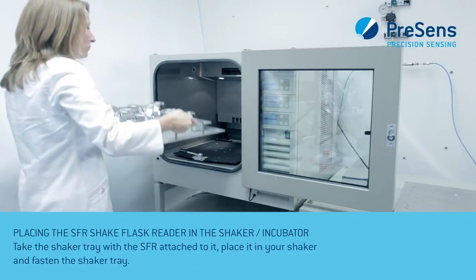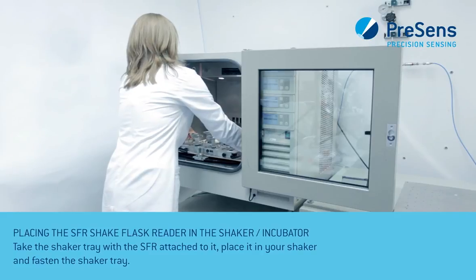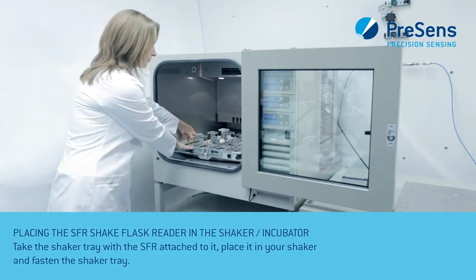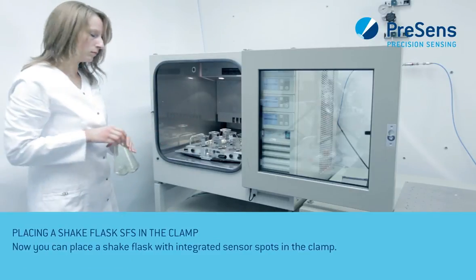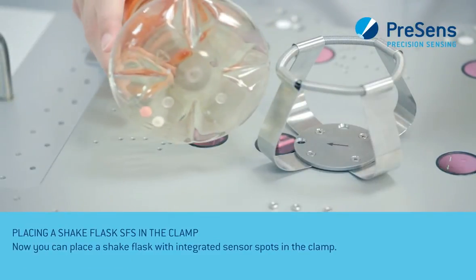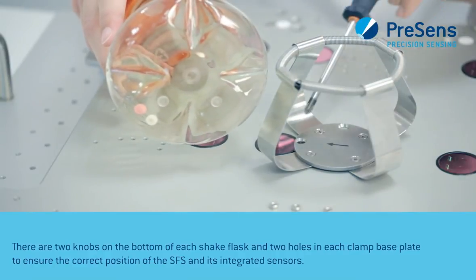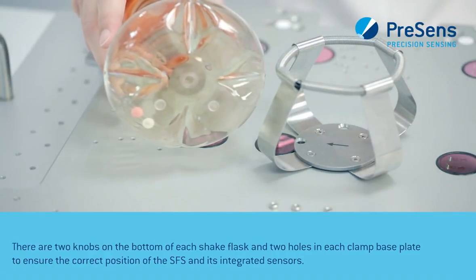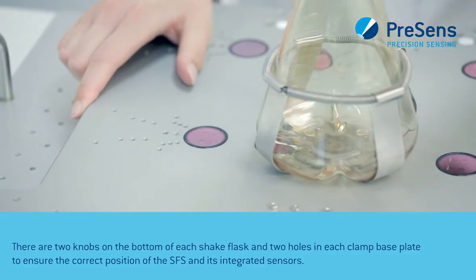Take the shaker tray with the SFR attached to it, place it in your shaker and fasten the shaker tray. Now you can place a shake flask with integrated sensor spots in the clamp. There are two knobs on the bottom of each shake flask and two holes in each clamp base plate to ensure the correct position of the SFR and its integrated sensors.